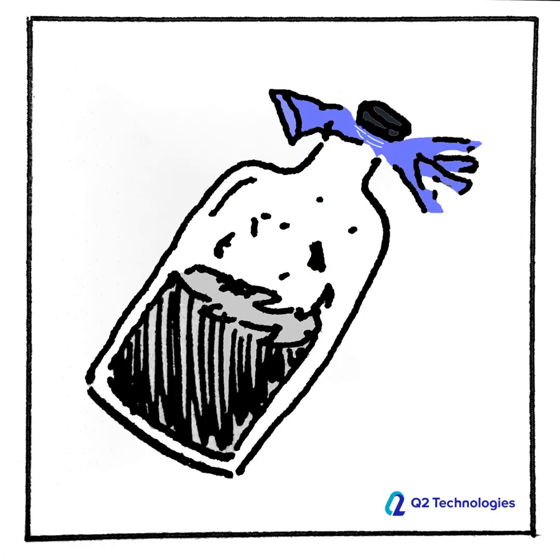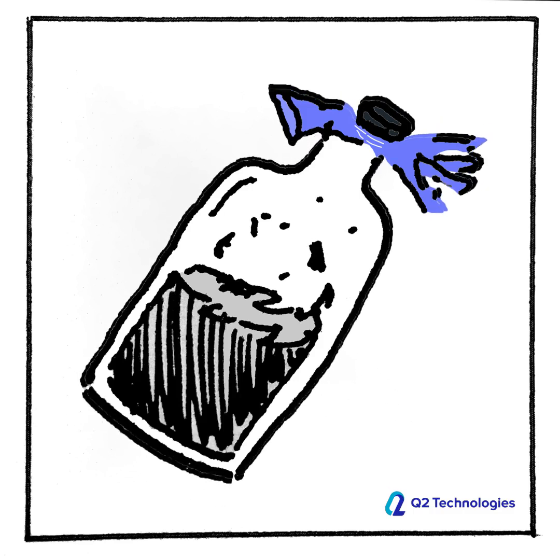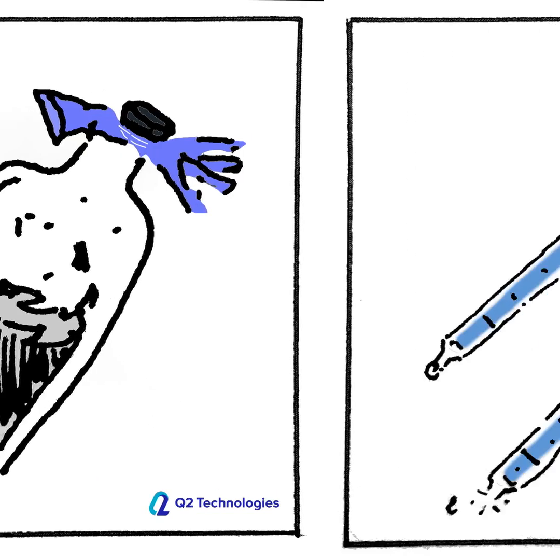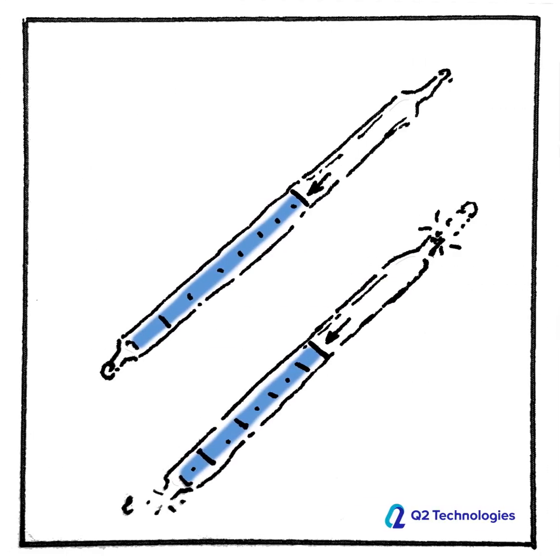As part of the ASTM 5705 testing procedures modified for the field, we vigorously shake the sample for one minute. This further breaks out the H2S. Then we select a detection tube that matches the range we might expect for this particular sample, and we break the ends off to open the tube to atmosphere.